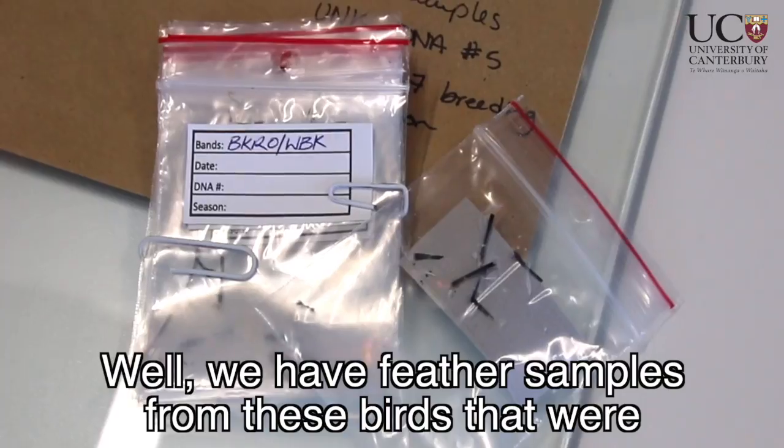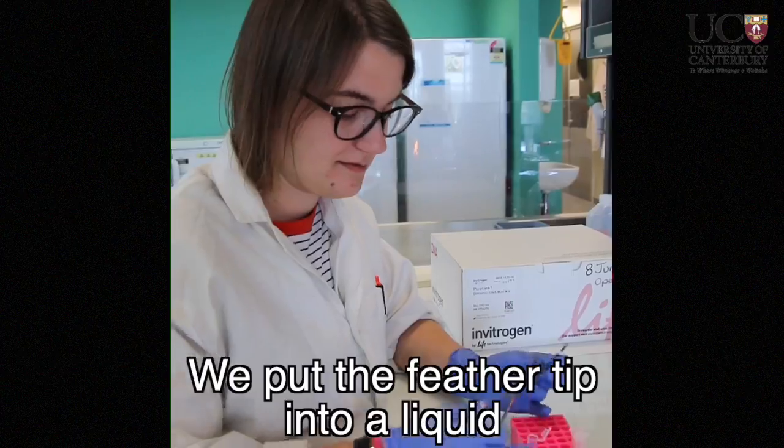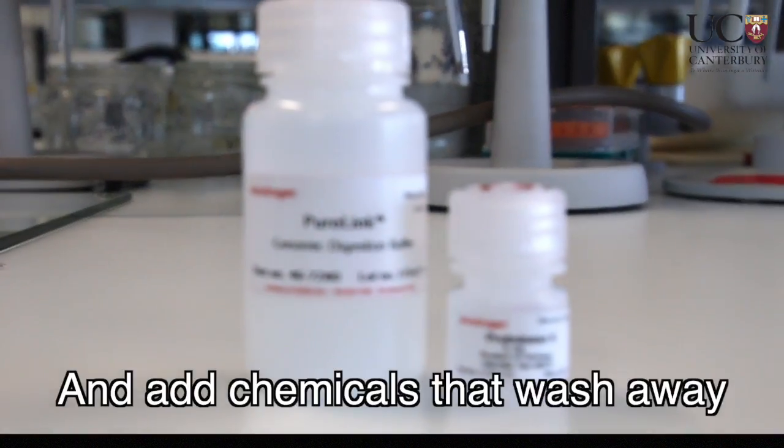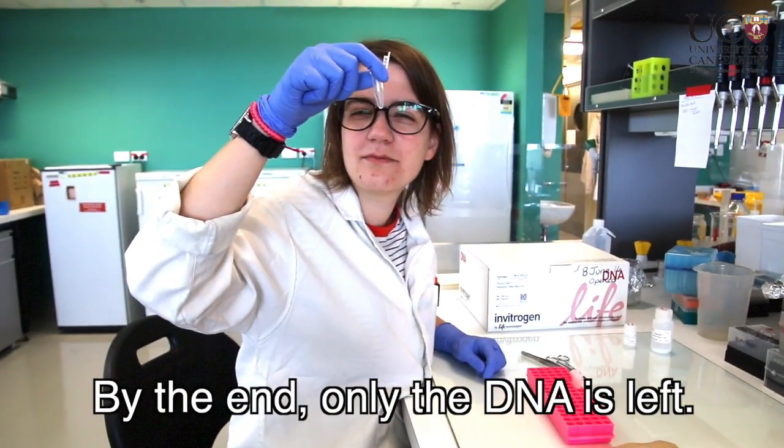We have feather samples from these birds that were collected when they were babies in the captive breeding facility. We put the feather tip into a liquid that breaks up the feathers and add chemicals that wash away all the parts that aren't DNA. By the end, only the DNA is left.